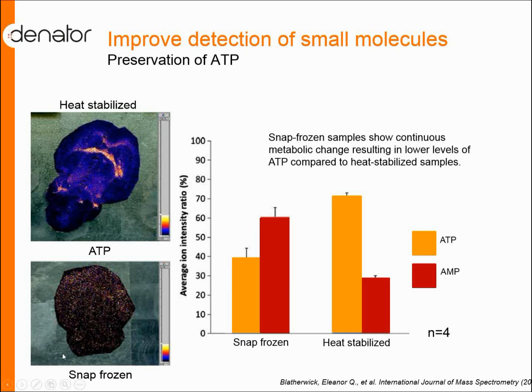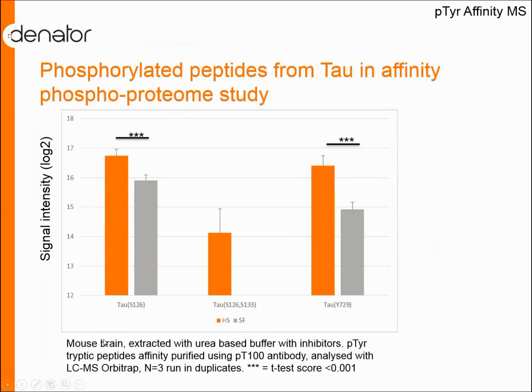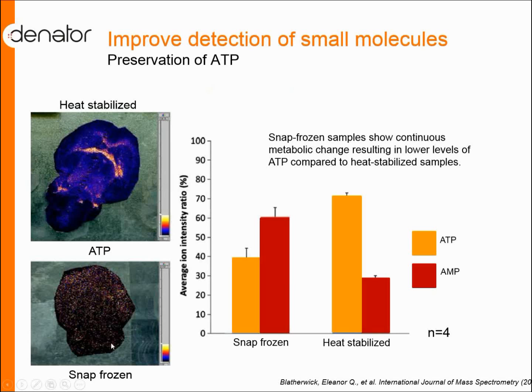In the snap-frozen lower panel, let me see that. In the lower panel, we have the snap-frozen sample. It's more of a general background noise that we see here.